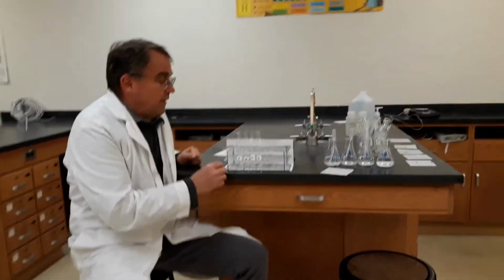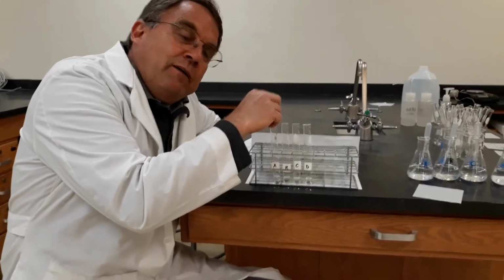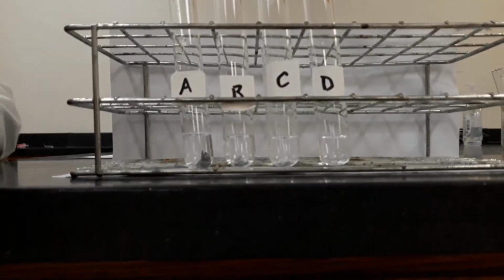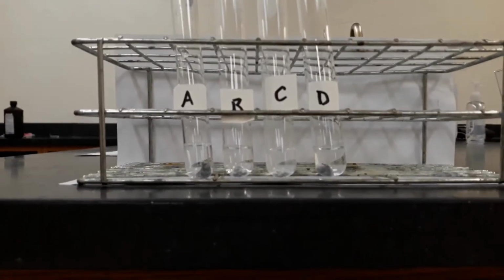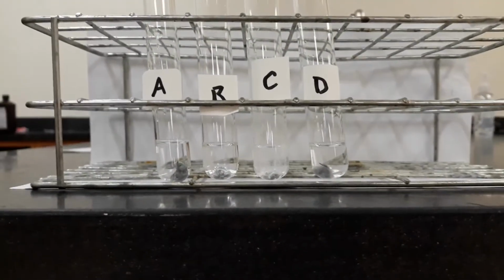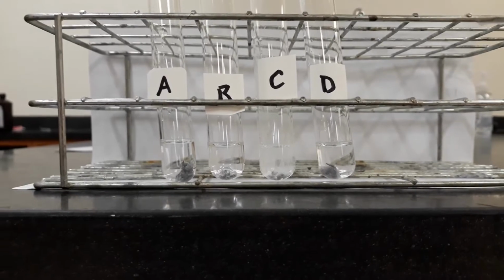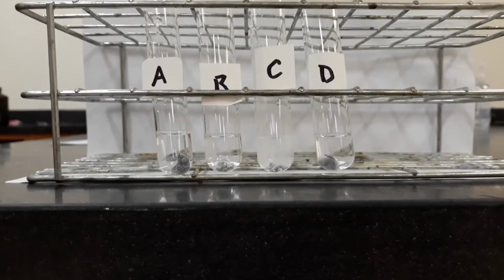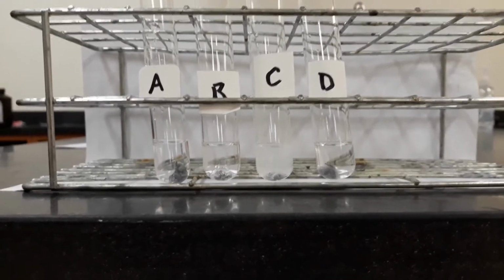Still under the reaction of metals, now we're going to react zinc with the different substances. If you remember from the periodic table, zinc is less reactive than magnesium. So we put zinc in A, B, C, and D. And again, we see C is reacting quickly, B slowly, and A and D are sitting there like so much lumps of zinc.